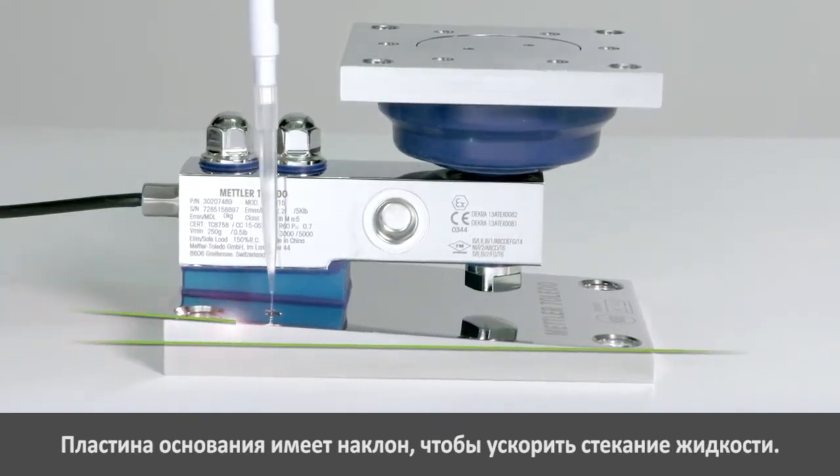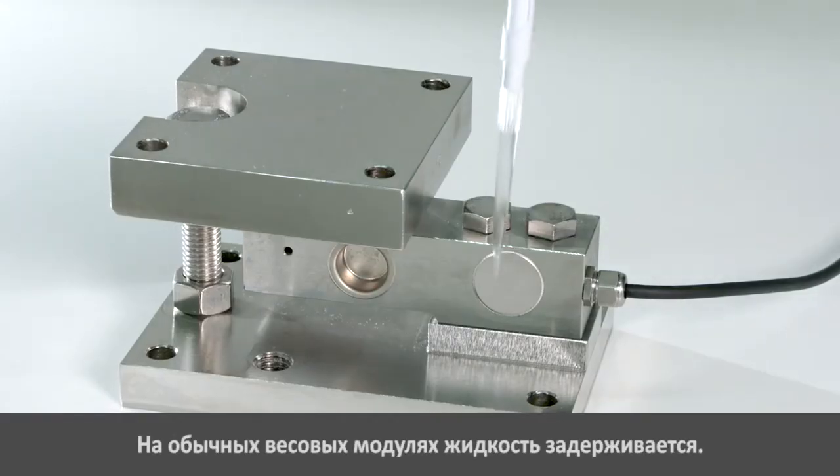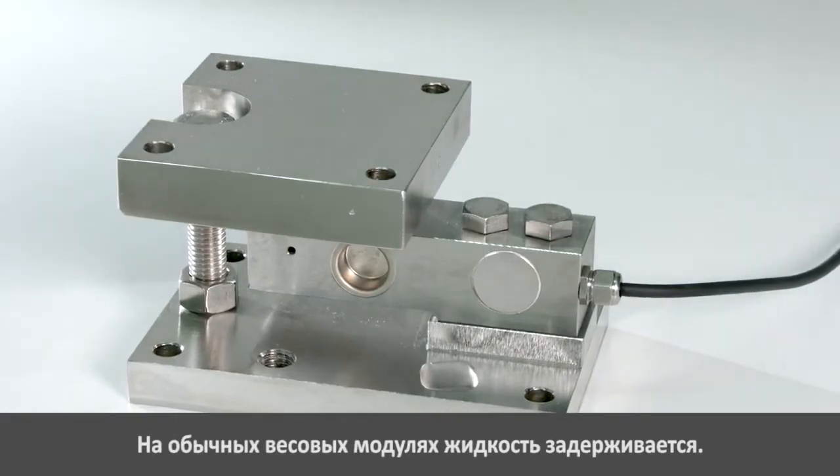The base plate is angled for quick self-draining. On the contrary, liquid remains on traditional whey modules.